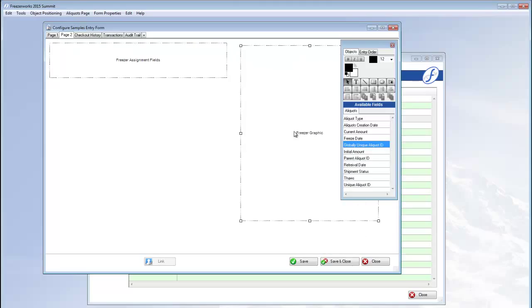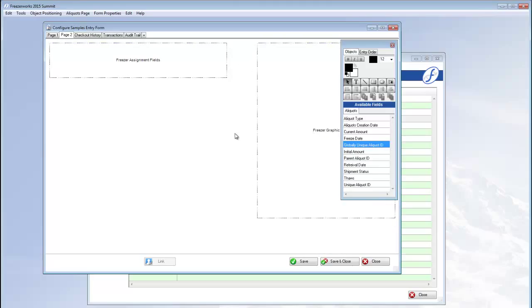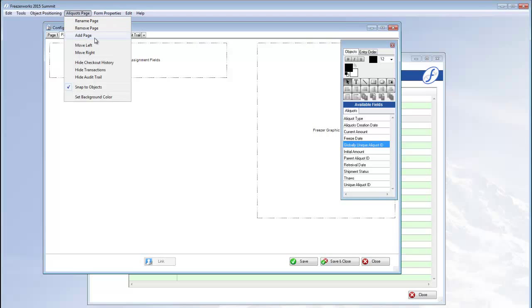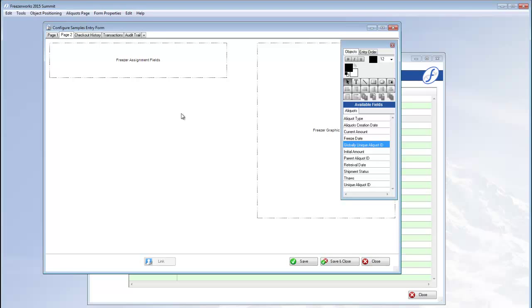You can add as many pages as you want to your aliquots form by clicking the plus sign or aliquots page add page.